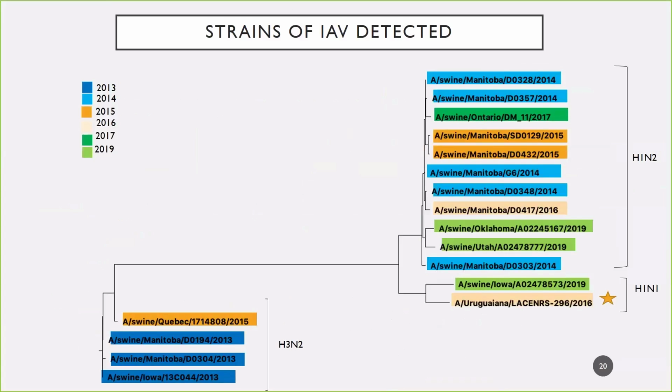And so this is just a mini phylogenetic tree of the different strains of influenza A virus that we detected through sequencing. And the different colors represent the years of the influenza A virus that it was first detected. And so just to reiterate, these are samples that were collected all on one farm. So even on one farm, we could find 13 different influenza A virus strains. And this, again, is evidence for potential reassortment events to occur between the different strains. Next slide.